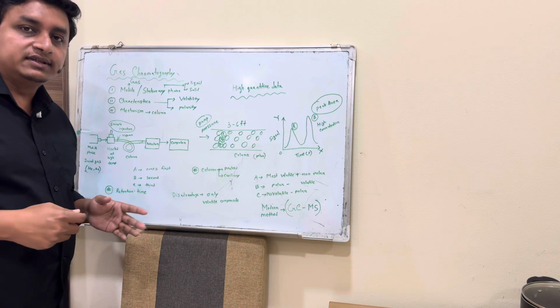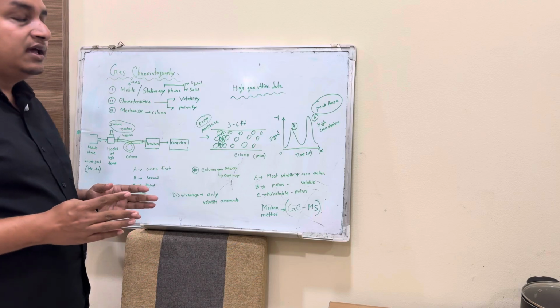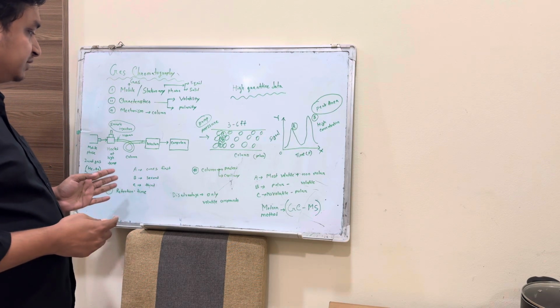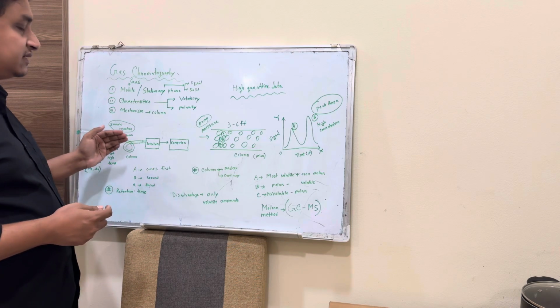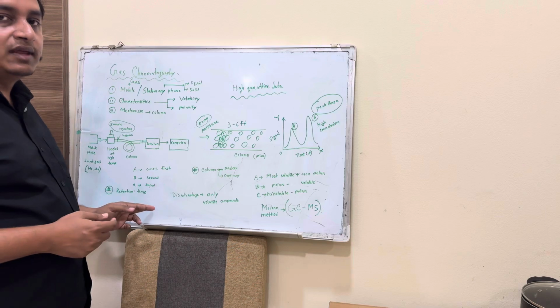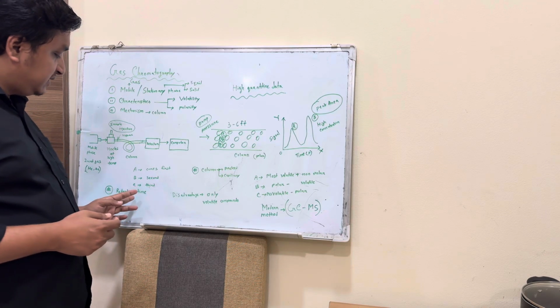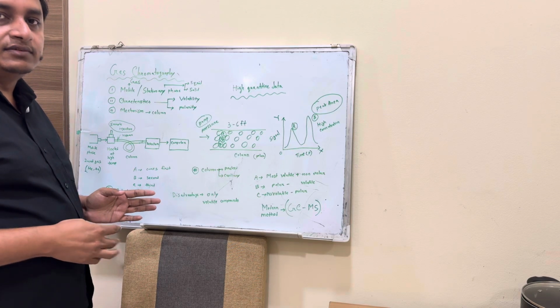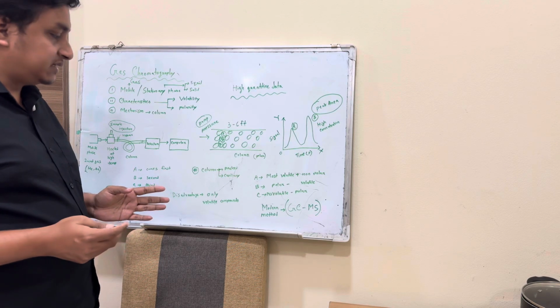I don't want to make this video long. I'm just telling you the basic principle of these. The time it takes for a molecule to reach the detector is called retention time. According to the retention time, we can find out which organic compound we are detecting.